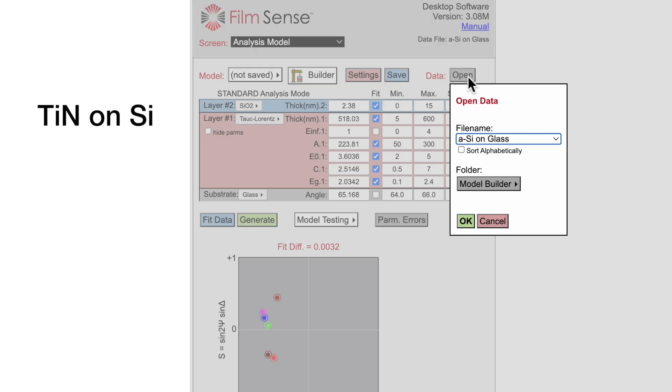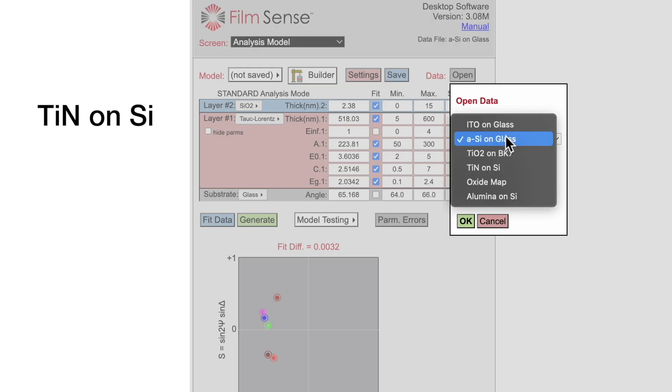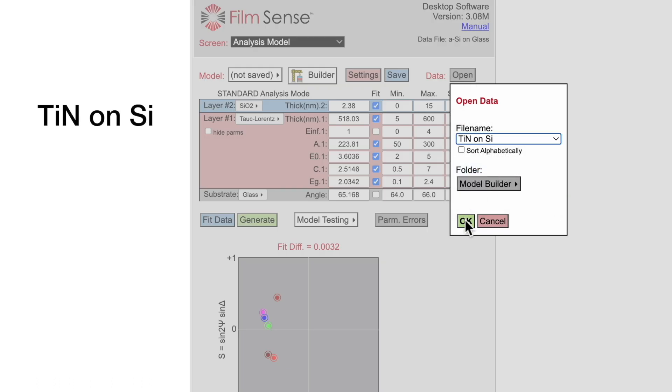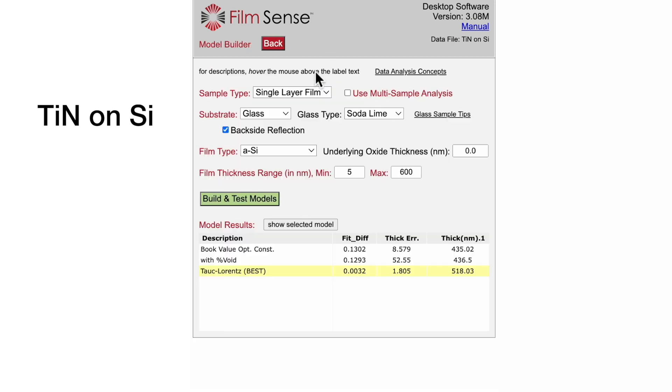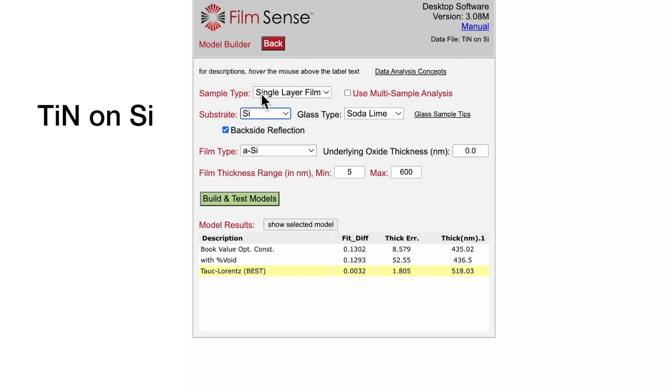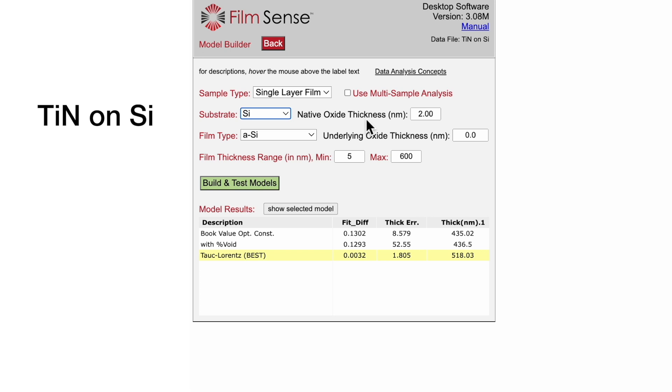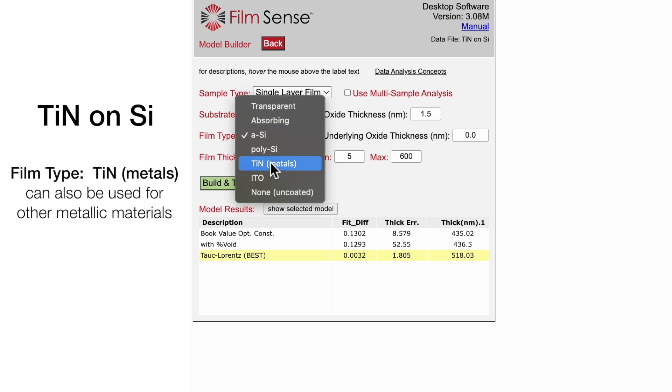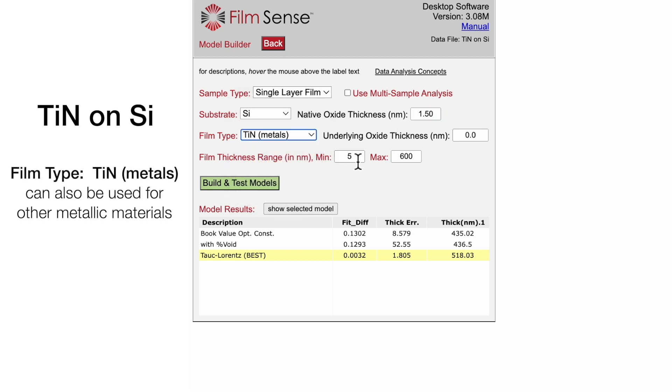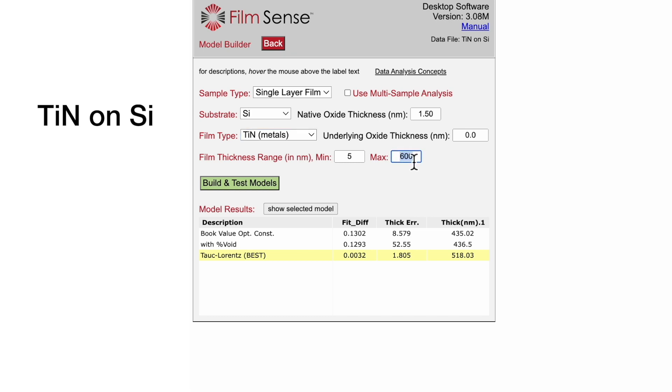Next, we will consider a metallic film, titanium nitride on silicon. We will go back to a silicon substrate, and this film was deposited on a high-quality wafer that only had 1.5 nanometers of native oxide. We will select a film type of titanium nitride and limit the maximum thickness to 50 nanometers.